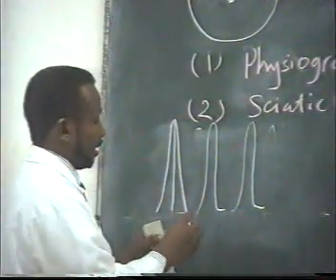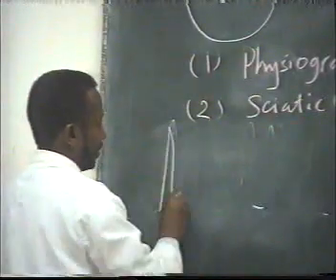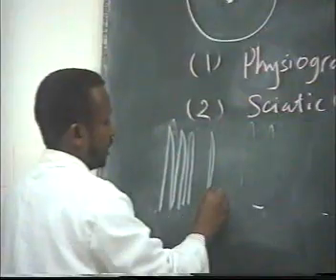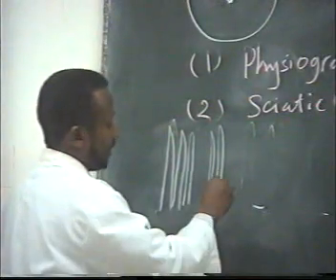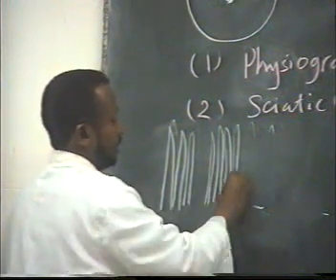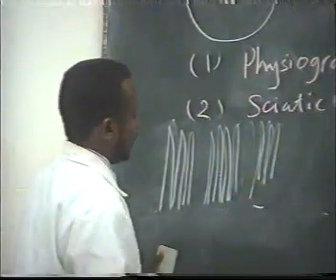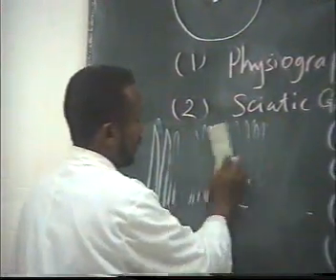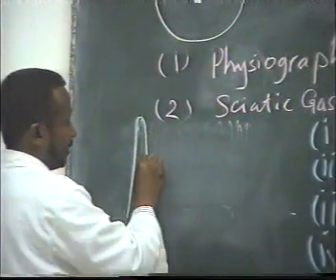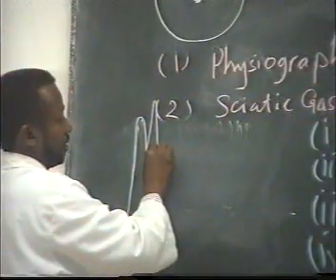They become more close to each other. So as we increase the frequency, they become more close until they become fused like that. And when we increase the frequency further, before the muscle relaxes, we get another contraction, and this is known as summation.